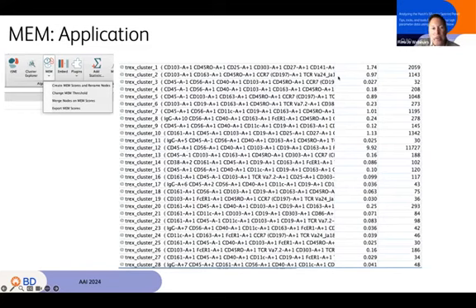What that's going to do is on a per cluster basis say, what was the most important marker that made this population get identified as a standout cluster, and give it a rating. So a lot of these clusters are just getting a plus one. So they're a little bit brighter, or maybe even a minus one. We'll probably find one or two of those in there somewhere. A little bit brighter than the average cluster.